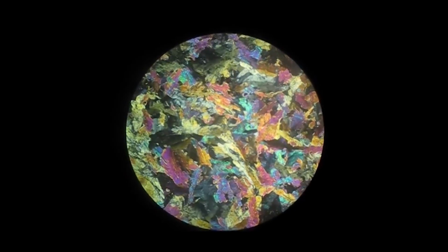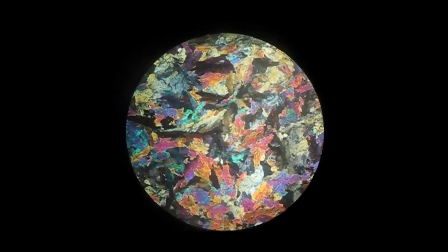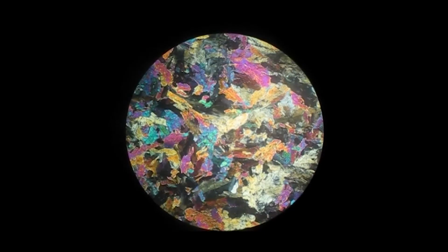The property of twinkling is useful in identifying some of the anisotropic minerals. In order to identify doubly refracting minerals, the optical property birefringence plays a significant role. Thus, with the petrological microscope, the properties depending on light, such as refractive index, twinkling and birefringence, are unavoidable tools for the identification of minerals and minerals present in rocks.